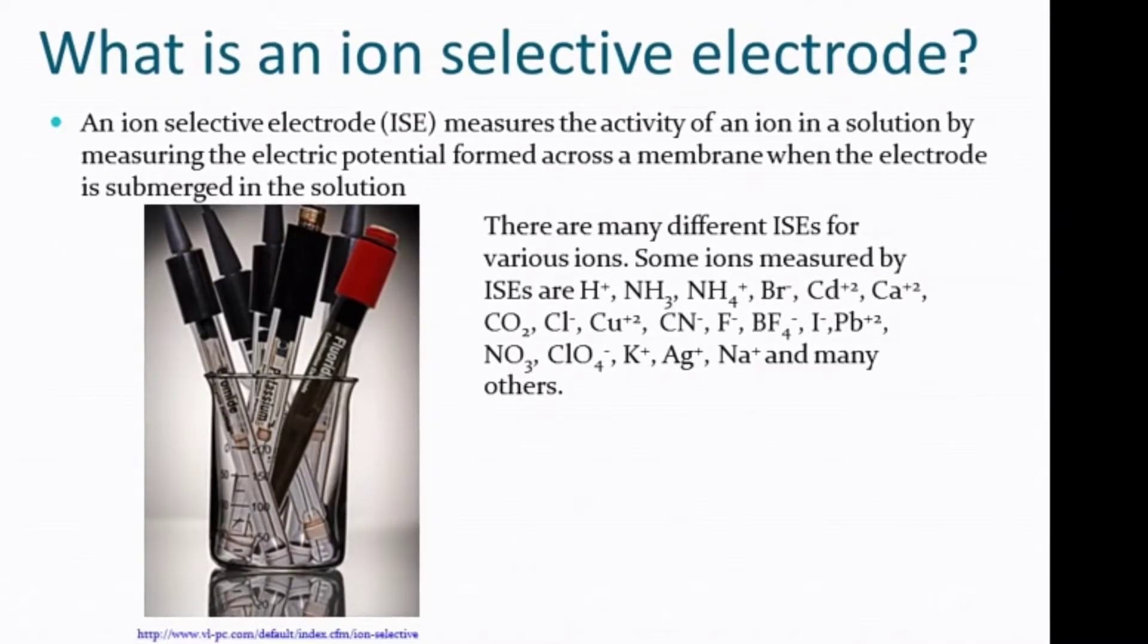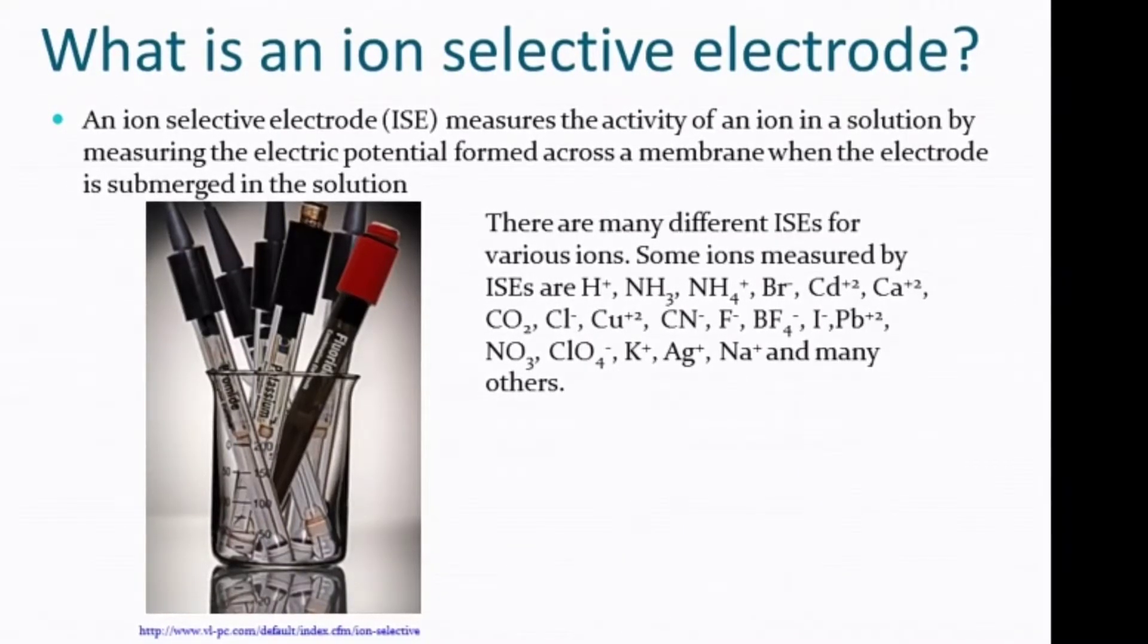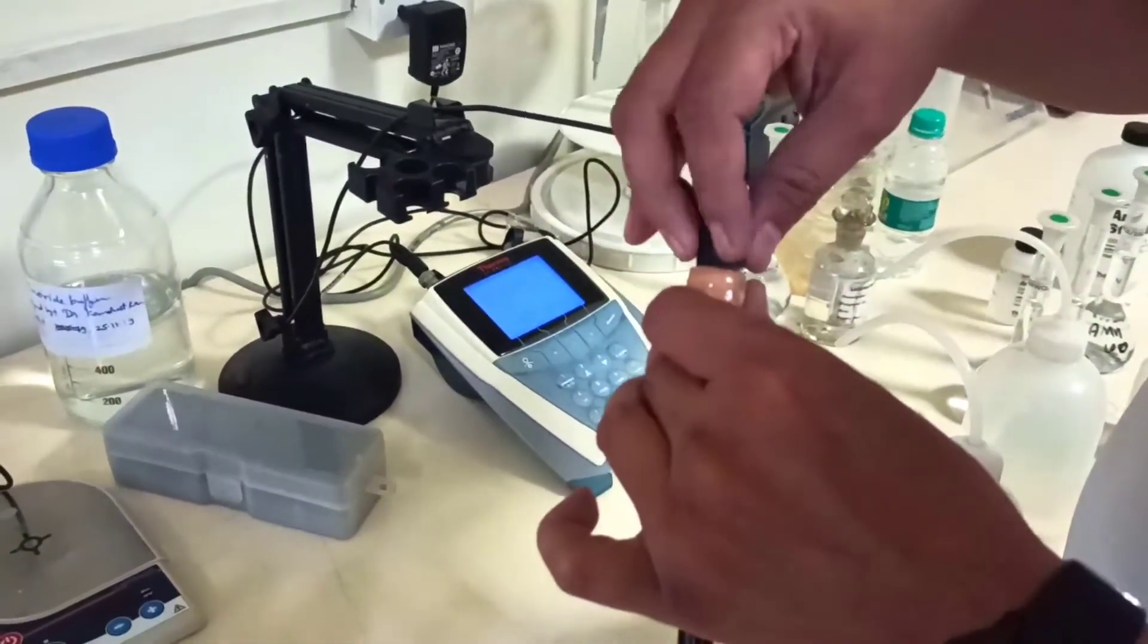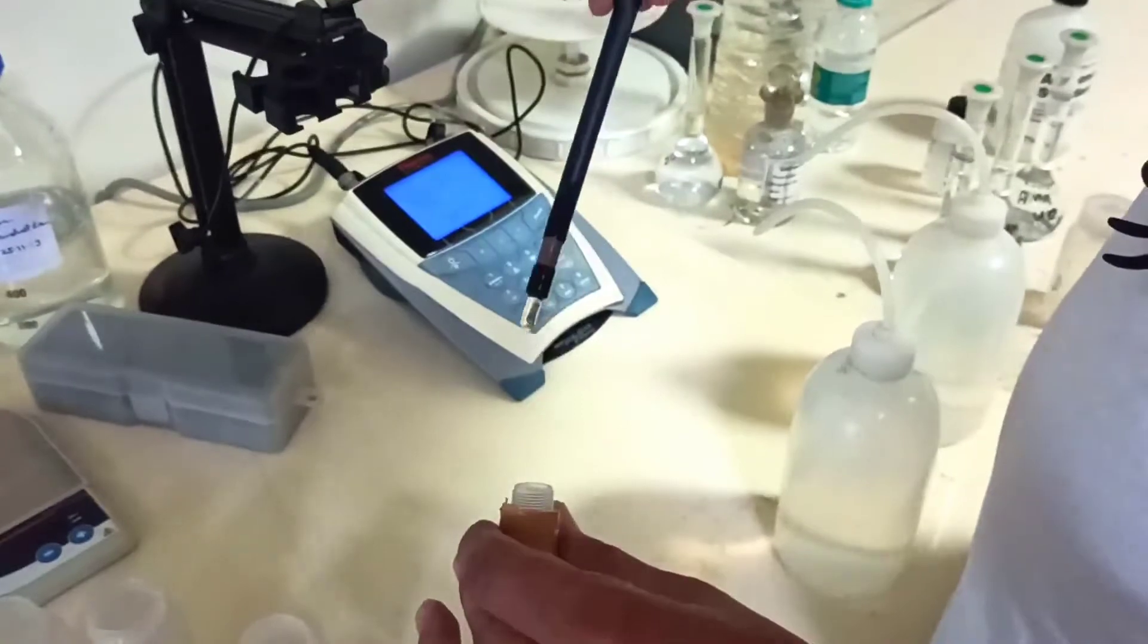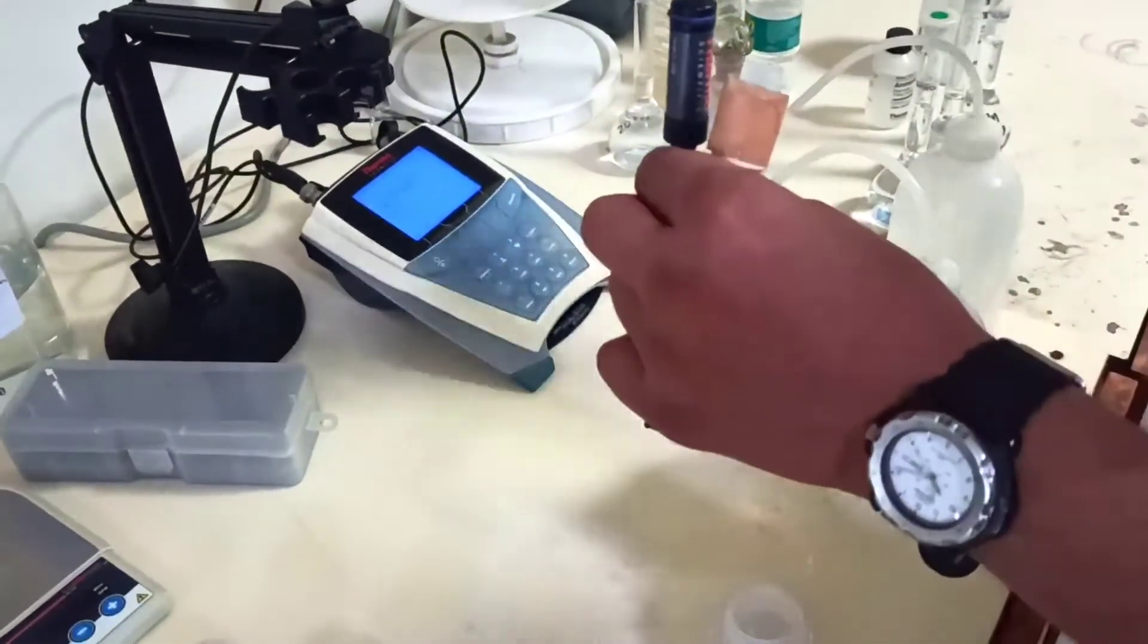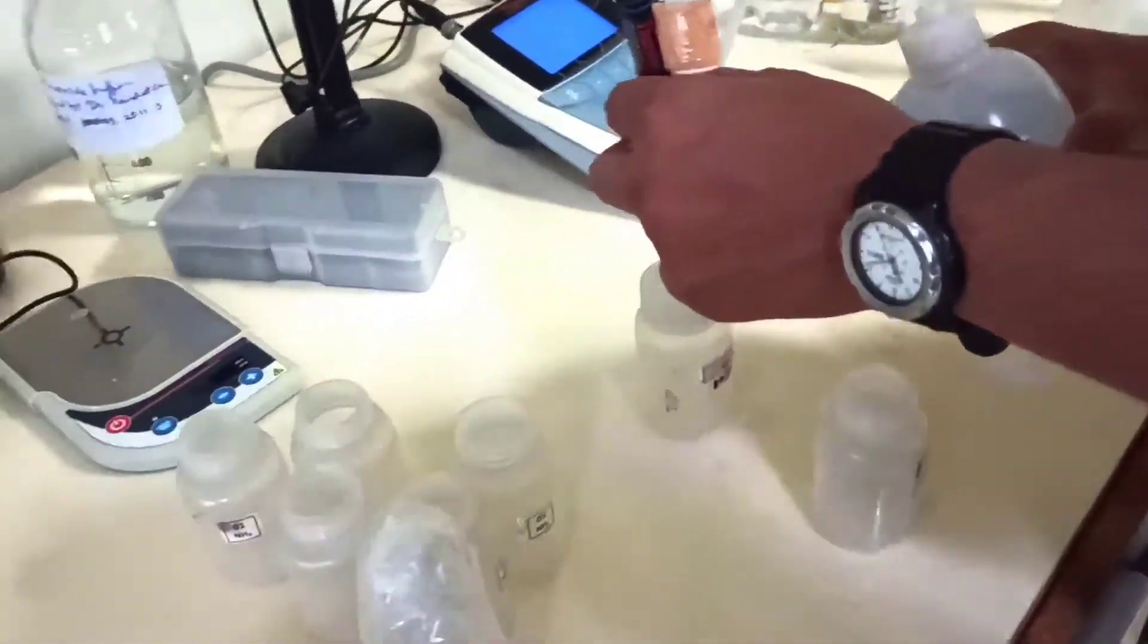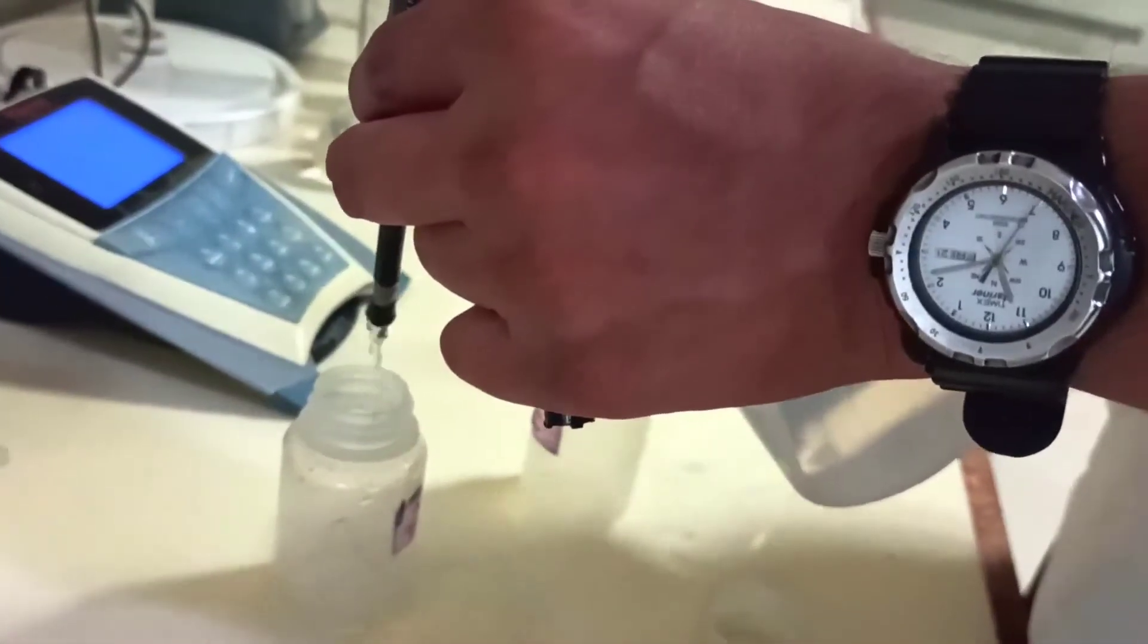Now how to fill the filling solution in the ion selective electrode of ammonia. Carefully remove the outermost case of the ion selective electrode. It has a very delicate bulb. Handling in a proper manner is very important. We clean our bulb with distilled water. The distilled water conductivity should be zero because this bulb can be polarized.